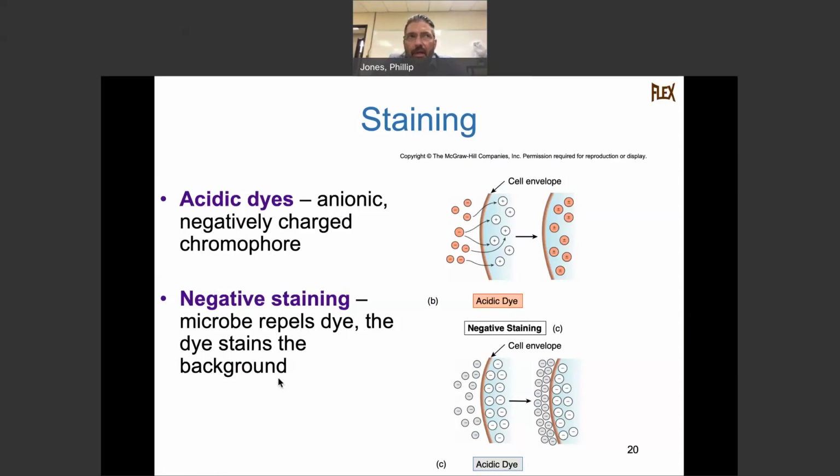So if we're talking about, theoretically, a capsule stain or something, some of the capsules wouldn't absorb the dye anyway. Or if it's acid fast or Mycobacterium, it has that mycolic acid on it. We can't get it to absorb the dye, but at least we can stain the outside of it. Sort of like contrast dye if we were doing a barium swallow or something like that, right?